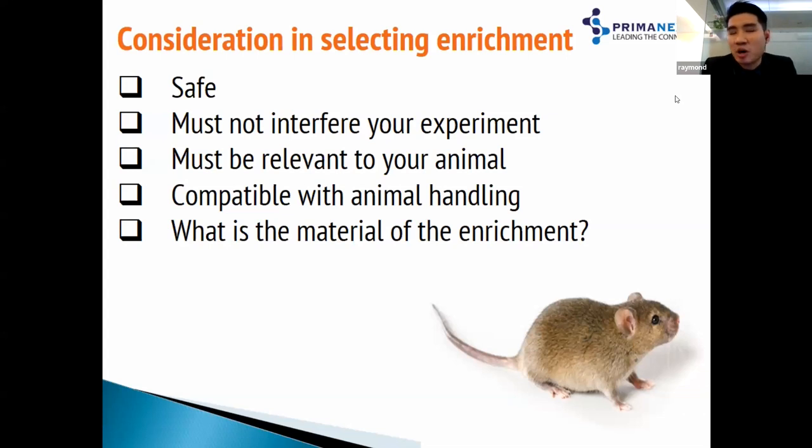Fourth, it must be compatible with animal handling. You do not want anything that will interrupt or interfere when you would like to handle them. We know that wild rodents, wild mice and rats, in their daily activity like to do burrowing. They like to go into all these small holes, dig up and stuff like that.